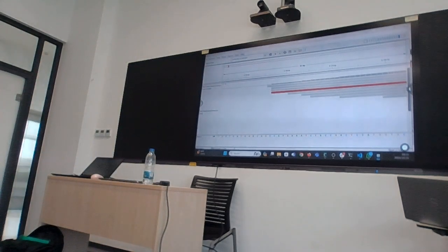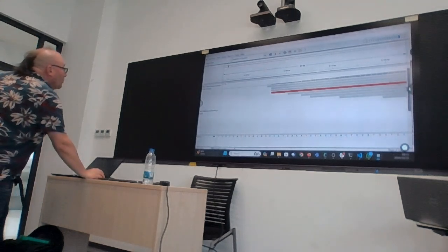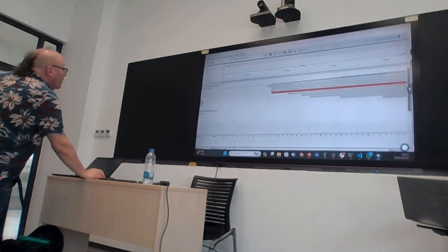And in the sample data, I want to show you something. I hope that it's the right stuff. Let me just show you. Let me see if I can find this.